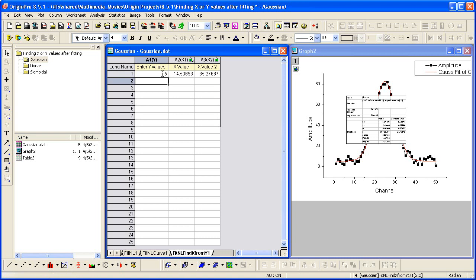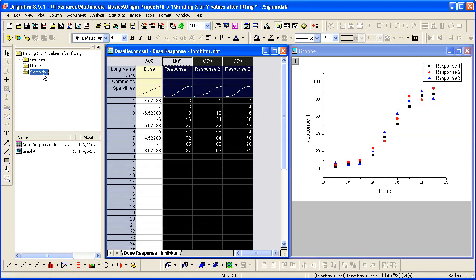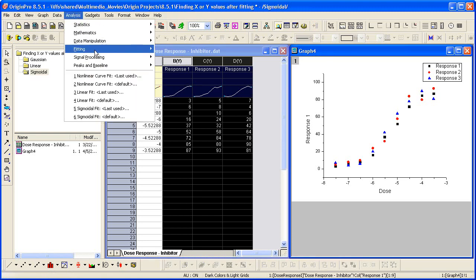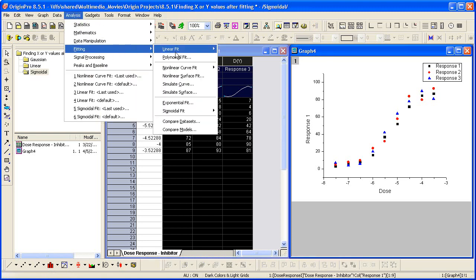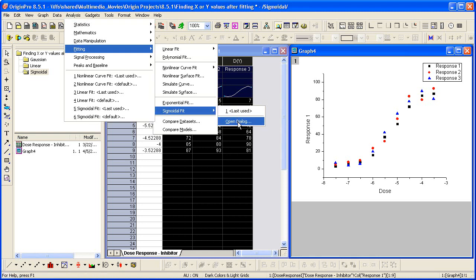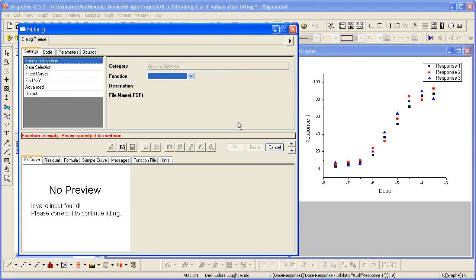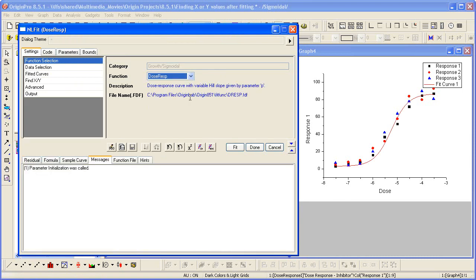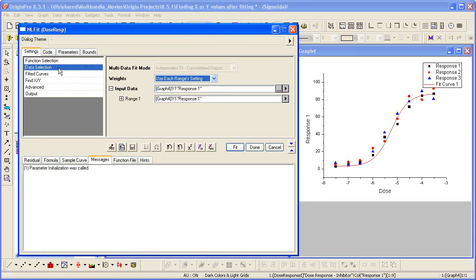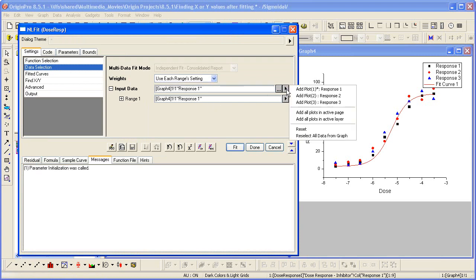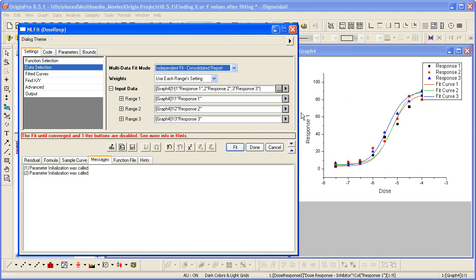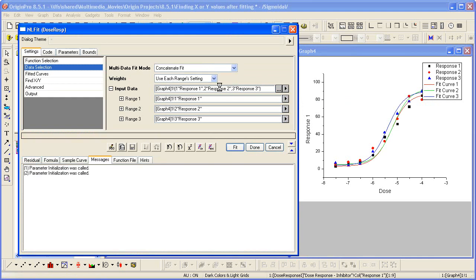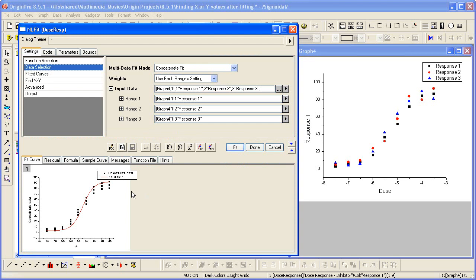Let's look at one last example. We have some sigmoidal data here. Let's go ahead and fit this again from the graph. We do have a sigmoidal fit option. It opens up the same fitter but to this growth sigmoidal category. So I will choose Dose Response. Data Selection, I want to specify multiple inputs. I want all the plots in the active page. And then I want to fit all those points together and give me just one fit curve.